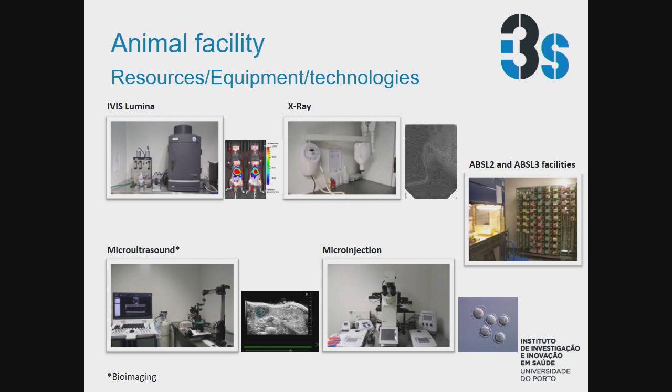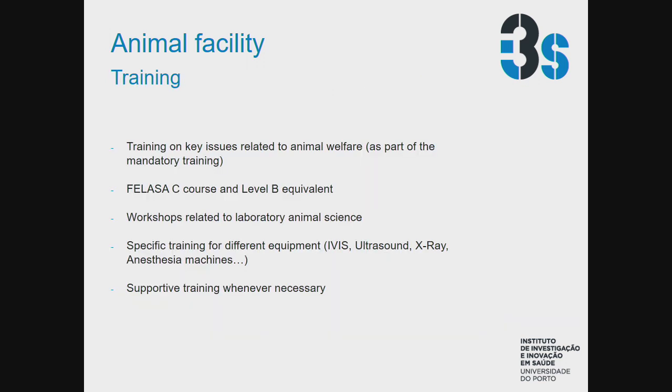And then the ABSL2 and 3 areas are areas that are fully dedicated to work with infectious agents. They both have dedicated animal rooms and dedicated equipment, from negative pressure IVCs to biosafety chambers. The rooms work in negative pressure, and they have all the conditions to work in a safe environment with infectious agents. In terms of training, we provide training on key issues related to animal welfare.